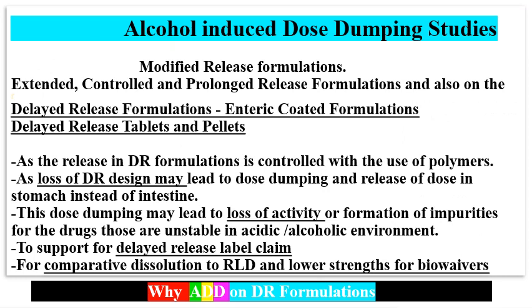So alcohol induced dose dumping is also required for some of the delayed release formulations, because in delayed release formulations the release of the dosage form is modified and there is a lag time in the release of the formulation. That's why for delayed release or gastro-resistant formulations, the dissolution is performed in 0.1 normal acid for 1 hour or 2 hours, followed by basic pH.